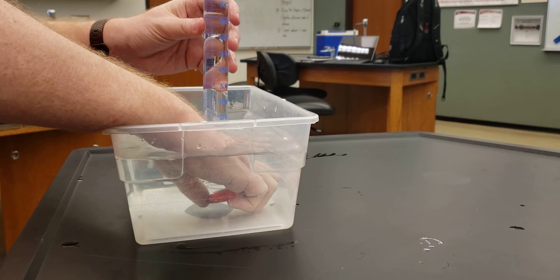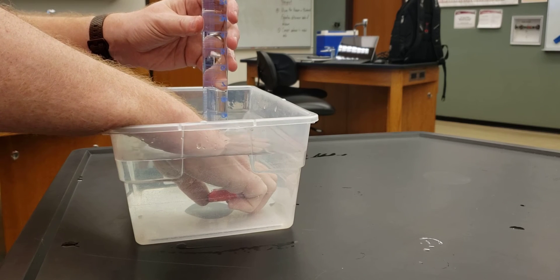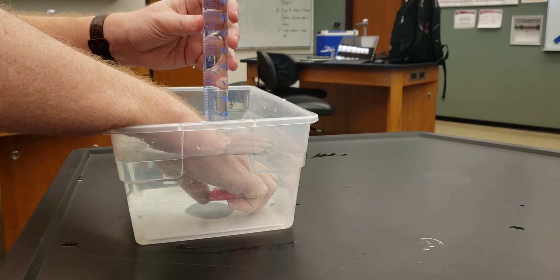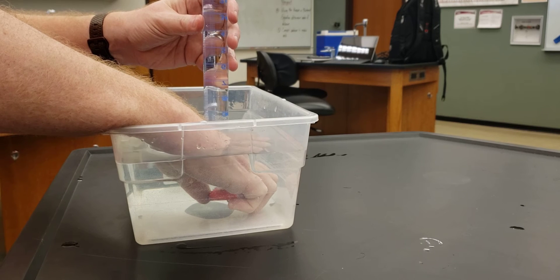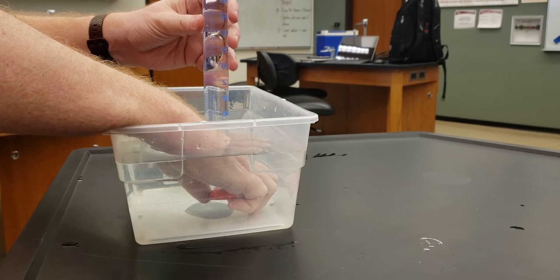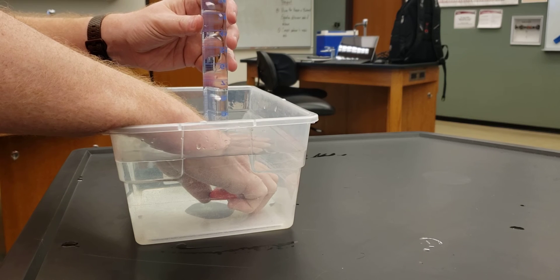Then we put our lighter underneath, depress the release valve, and let the bubbles collect inside the graduated cylinder. That allows us to know how much volume of gas we've collected.